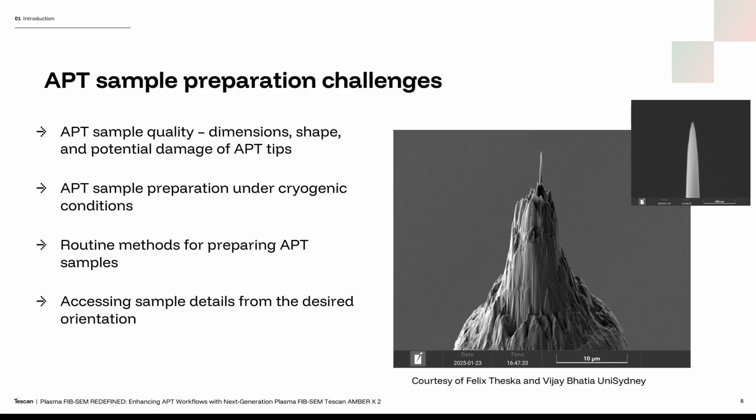And the last challenge that we see is to be able to access the sample details from the desired orientations, meaning that we are targeting a really small area, and during the preparation we don't want to miss the area of interest. And for that, we have to think a little bit outside of the box about how to prepare such samples and maybe change the geometry. And I will explain that on the following slides.